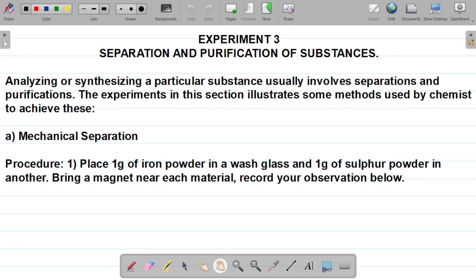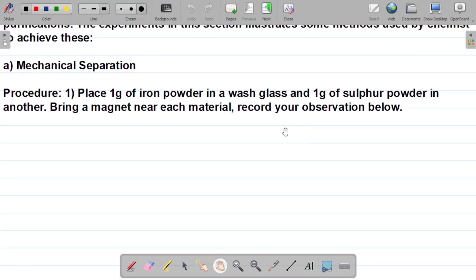The first method is mechanical separation. The procedure says: place one gram of iron powder in a wash glass and one gram of sulfur powder in another. So I have two glasses — one with iron powder and the other with sulfur powder. Now it says bring a magnet near each material and record your observation. Let's start with the iron powder.